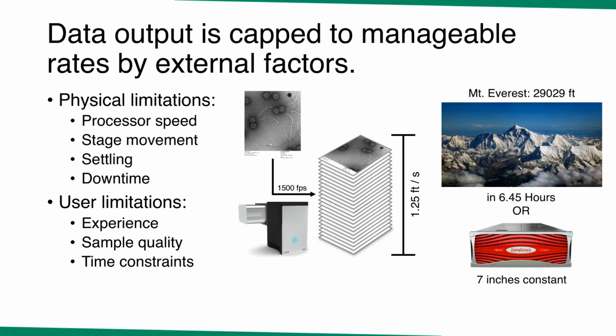I like to think about this, though, that if we were talking, say, that these images were still film, and we took the 1500 frame per second statistic from the K3, we could summit Mount Everest in 6.5 hours. Or you could just store it in about a 7-inch drive enclosure. So I'll let you guys decide there.